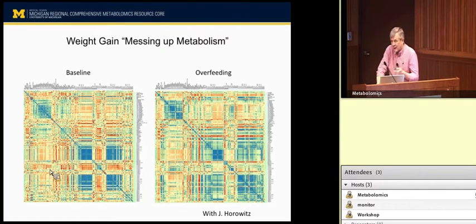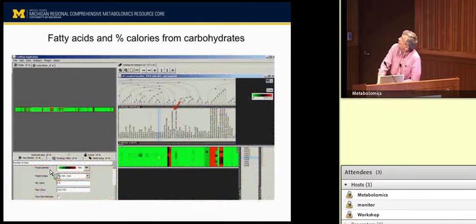So when you're thinking about your cancer patient who just got radiation therapy and is not feeling well, and you take their metabolome trying to predict their outcome, you have to remember that even those couple of days are really going to affect the metabolome. If you're going to have control groups, you need to think about the physiological status, especially in human studies. Obviously critters are a little bit easier to pair feed and things like that. All right.